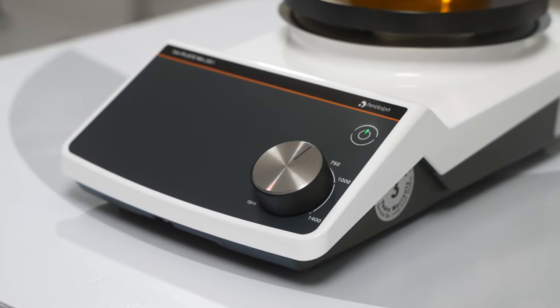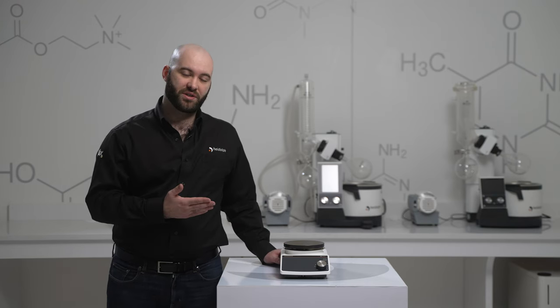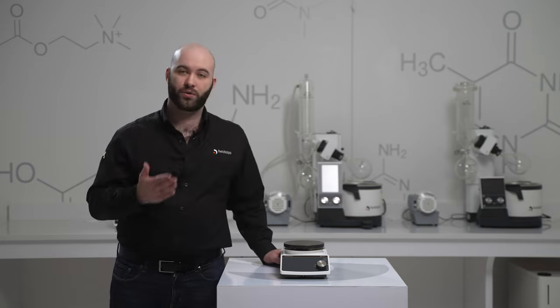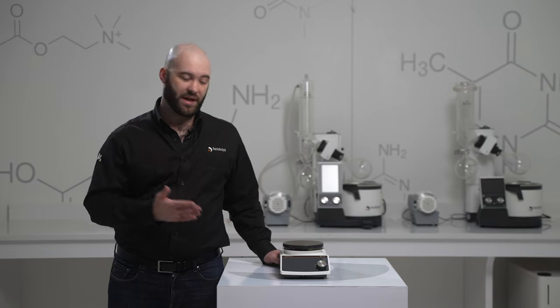Some returning safety features are the Keradisk top plate to provide strong scratch and chemical resistance while also facilitating strong heat transfer, and that die cast aluminum housing that prevents fires and the like.